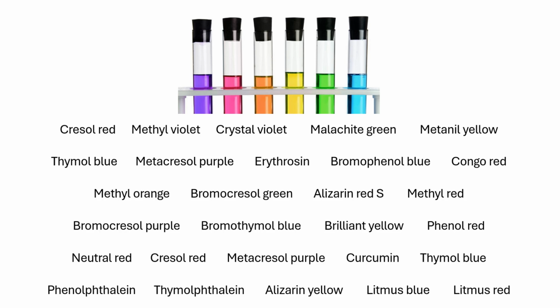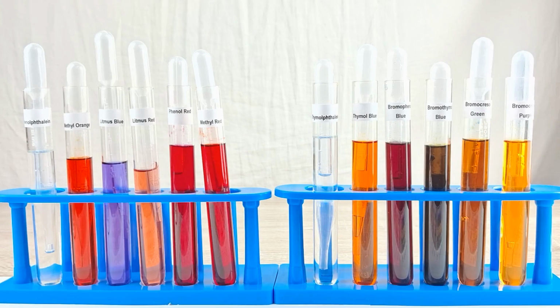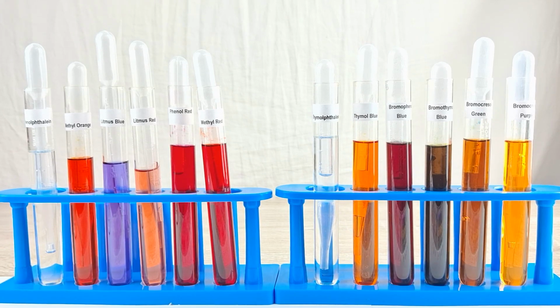In this simple yet visually satisfying experiment, we shall make a side-by-side comparison of how different acid-base indicators show striking color changes when exposed to an acid and a base sample. For reference, we shall also include a pH 7 neutral solution to see how they behave color-wise in such a neutral solution. To perform this experiment, we first gathered together an assortment of commonly used acid-base indicators.